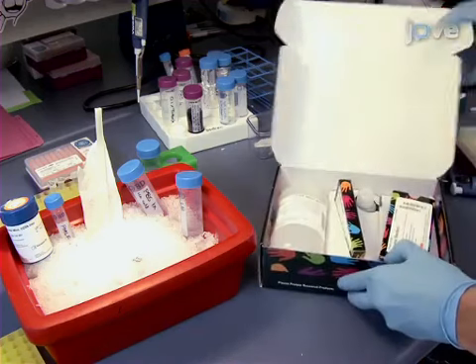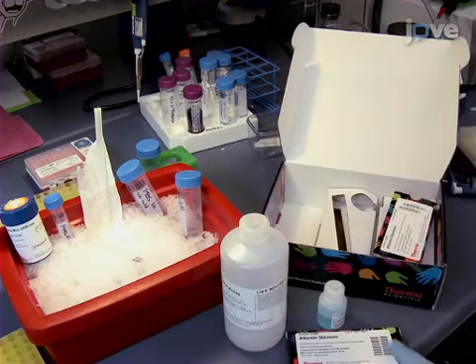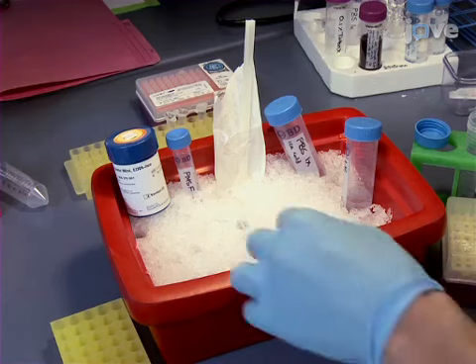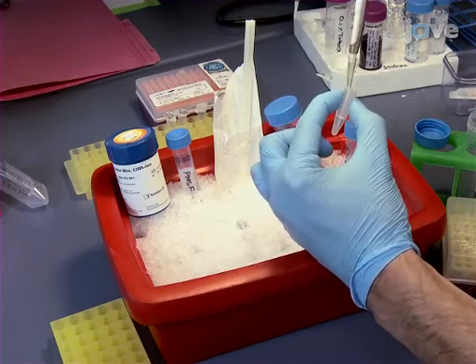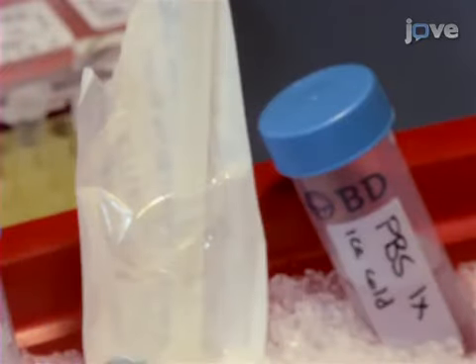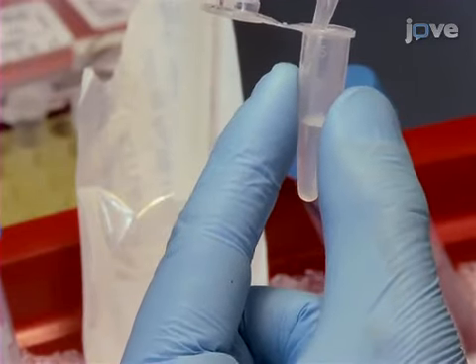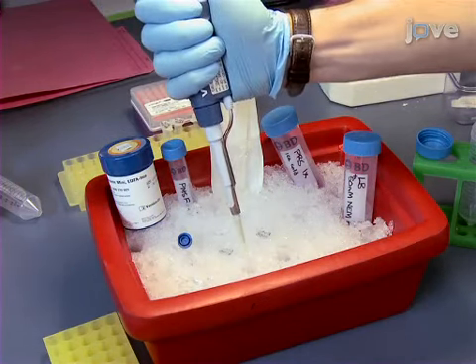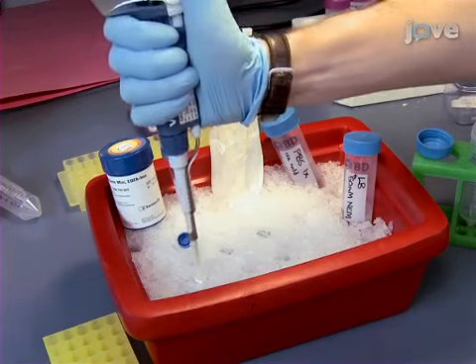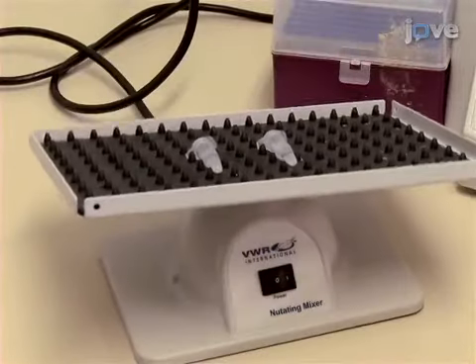Measure protein concentration in all lysate samples using the BCA assay as per manufacturer's instructions. Normalize the volume of all lysate samples from groups of cells to have exactly equal protein, with a recommended minimum of 500 micrograms. Top up all samples with lysis buffer plus 50 millimolar NEM to 500 microliters total volume. Next, add 1 to 5 micrograms of primary antibody directed against the target protein to each lysate sample. Nutate the antibody-lysate mixed samples overnight at 4 degrees Celsius.